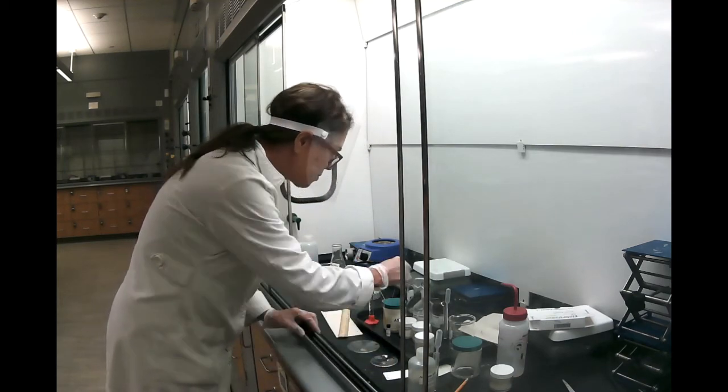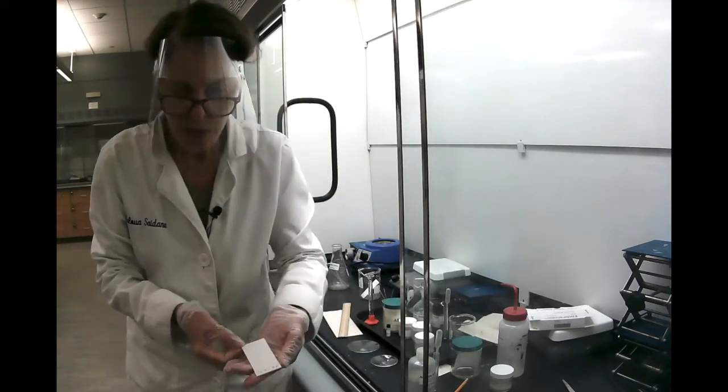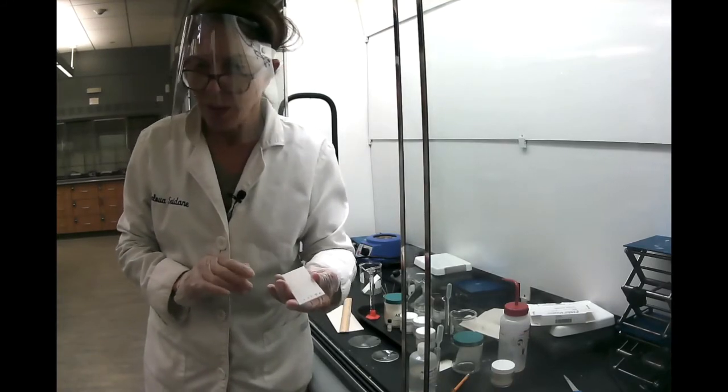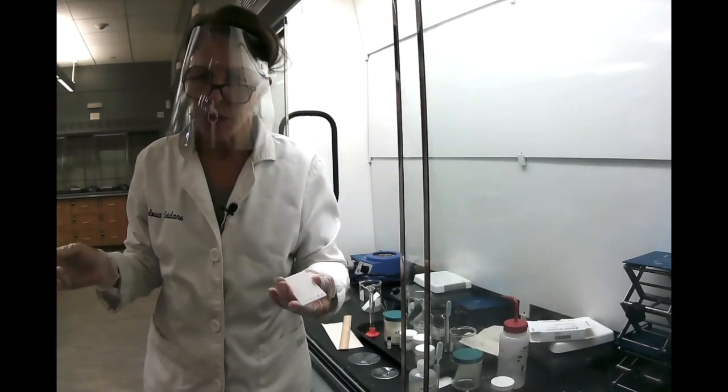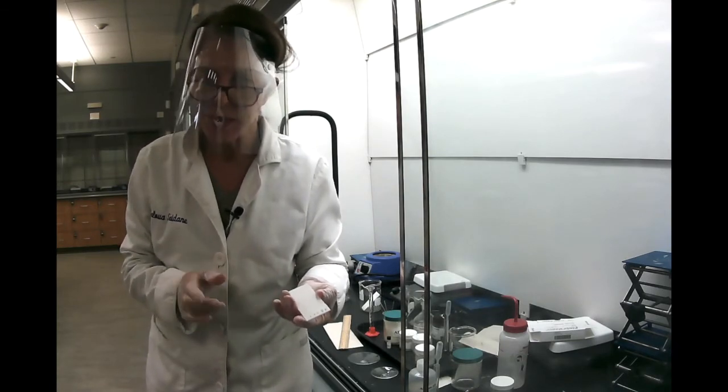So I think this is pretty good. Now we have our TLC plate ready. A good thing to do at this point is to check underneath a UV light if you have enough substance.